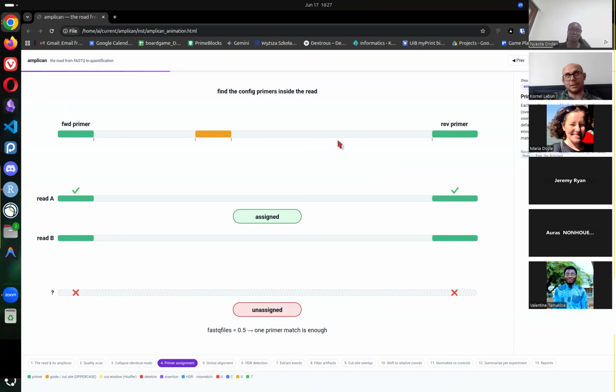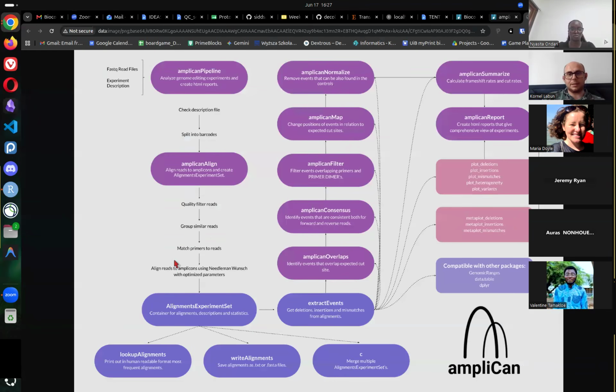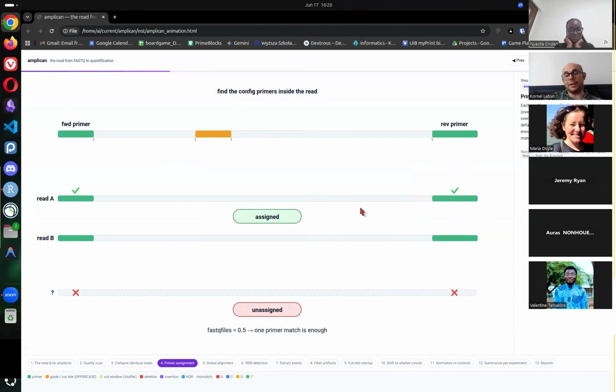And then you can see the QC a little bit in those reports, like the example one that I had here. The index report normally has some sort of QC, but it's not what you would expect. It doesn't really have in-depth QC about the quality of the FastQC itself. So you do that separately using dedicated tools.